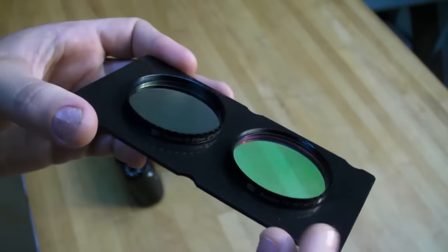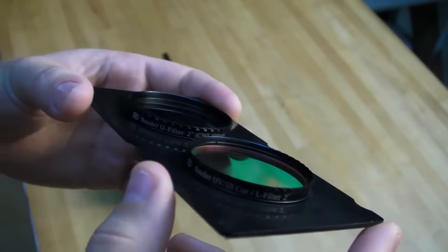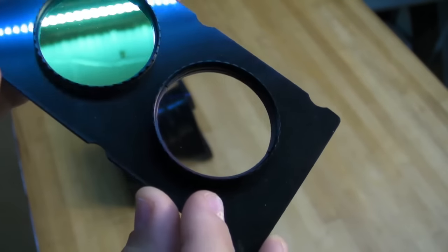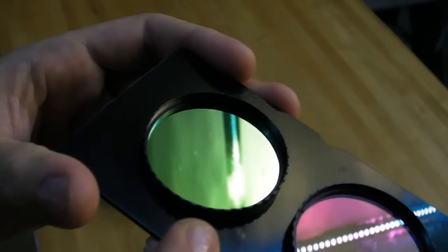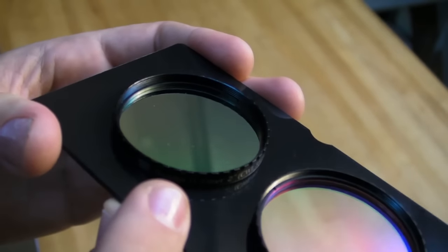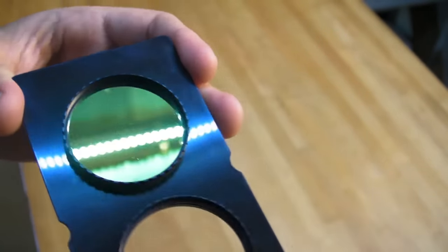For human visible spectra, we use this Baader UV infrared cut filter. This transmits all of the light between about 400 to 700 nanometers. And then to take UV photos, we use this Baader Venus U filter, which transmits all of the light between about 320 and 380 nanometers.